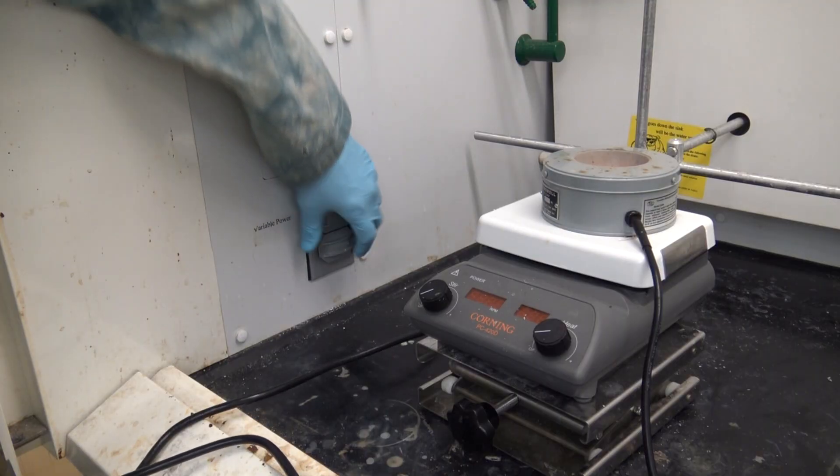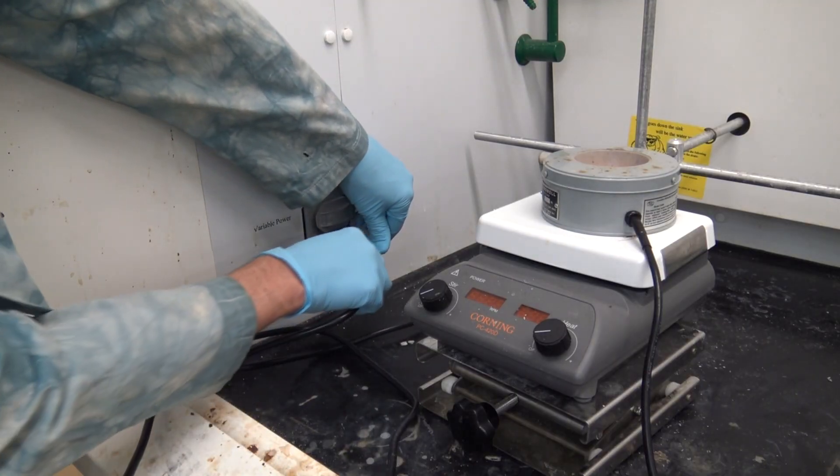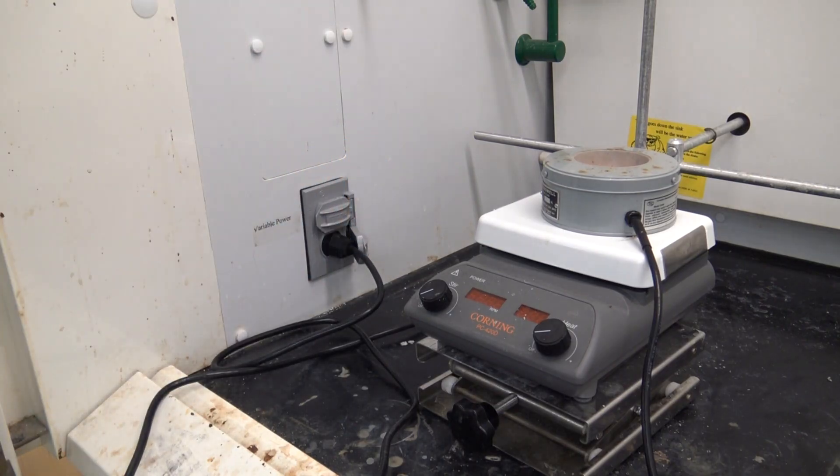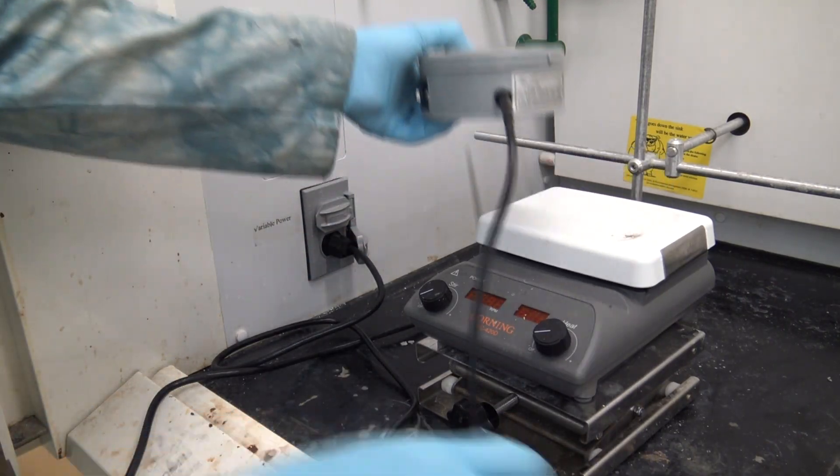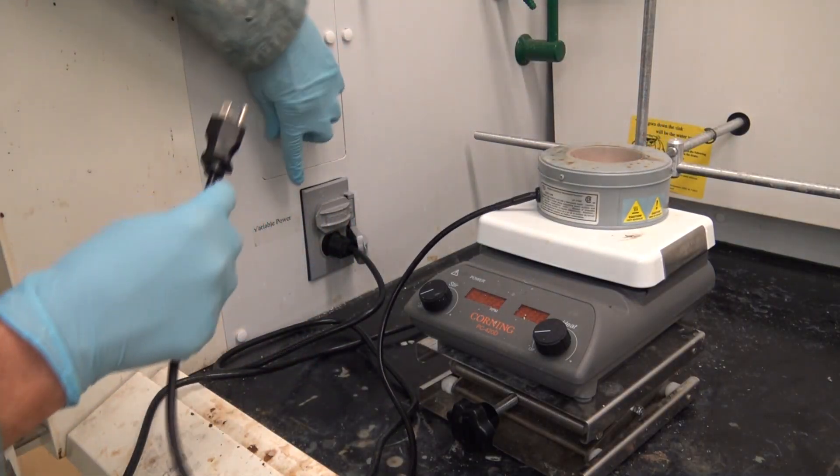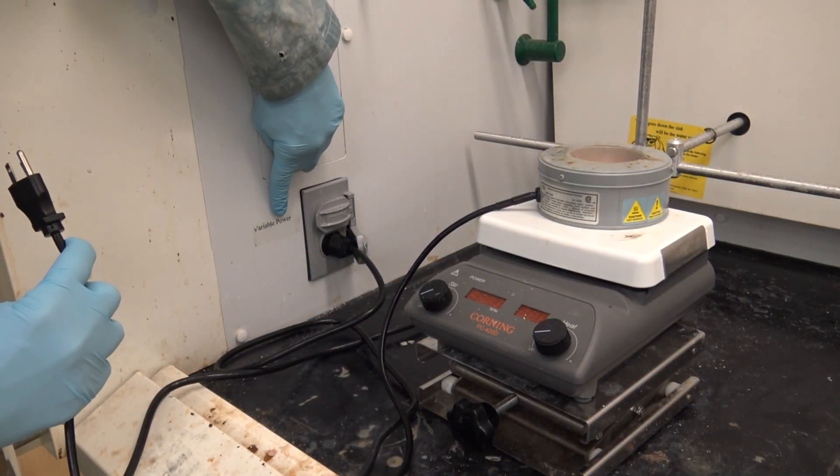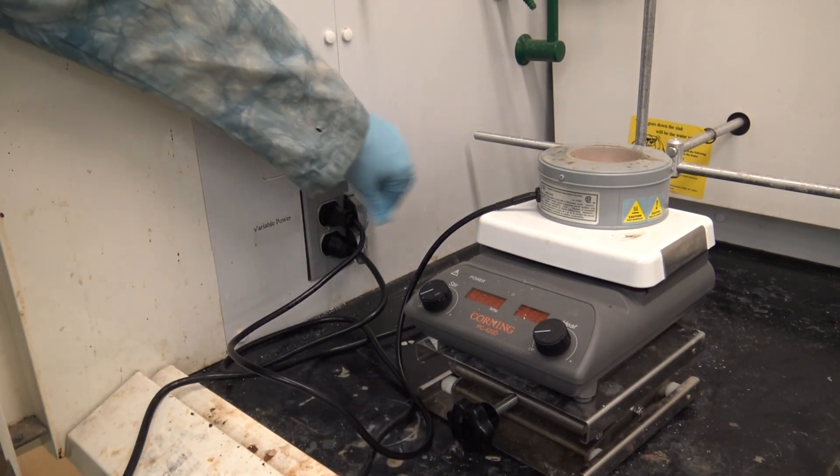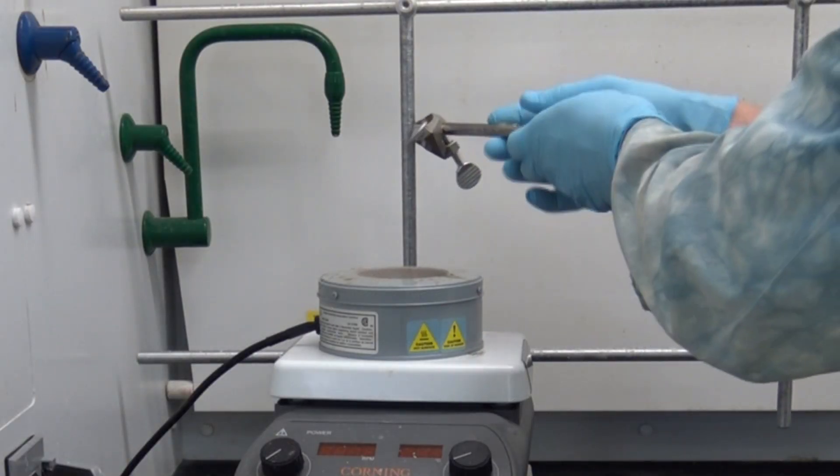We're going to plug our stir plate into the non-variable power outlet because we're going to use the dial on the stir plate to designate how fast that stirs. But our thermal well on the other hand, we've got an external control for that. So let's plug that into the variable power outlet, the one that's got the variable power marking right next to it.